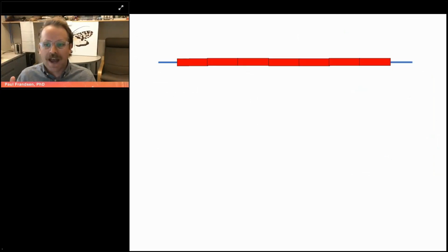This is a little cartoon that shows the structure of this gene. These little blue ends are the termini that are conserved, and they're non-repetitive. But internally, there are little blocks that are repeated over and over again throughout the length of the gene. Early high-throughput sequencing technologies generated very short fragments of DNA. Basically, you take your chromosomes, you cut up the DNA, and then you sequence these little short fragments, which we call sequencing reads.